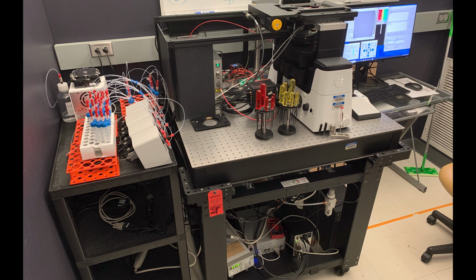To access the Perturb-tracing technology, a key requirement is to have an automated imaging and fluidics platform capable of chromatin tracing. We welcome researchers who are interested in setting this up to reach out to us, and we will provide instructions on several potential solutions for this setup.